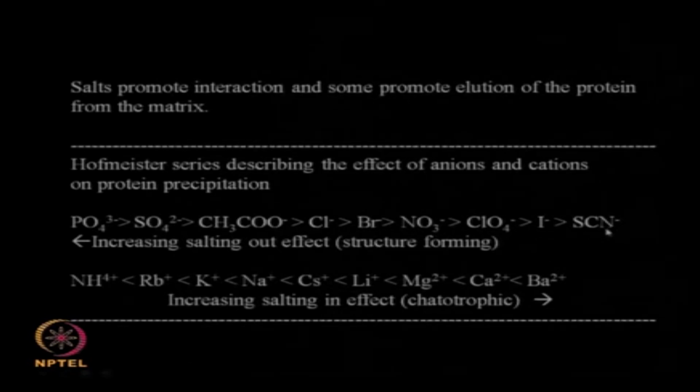So if I am moving from here to here, that is from the right to the left, I am enhancing the salting out effect, that is protein will be coming out, whereas if I am moving from this left hand end to the right hand end, I am enhancing the salting in effect. So this type of movement will enhance the interaction between the protein and the immobilized material, whereas when I am moving from this end to this end, I am increasing the solubility of the protein inside the solvent. So I am decreasing the interaction between the protein and the immobilized hydrophobic group.